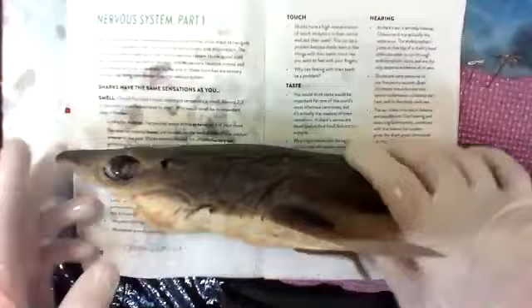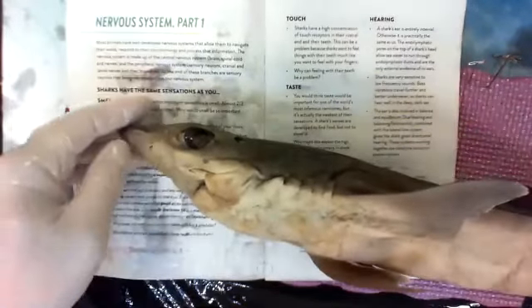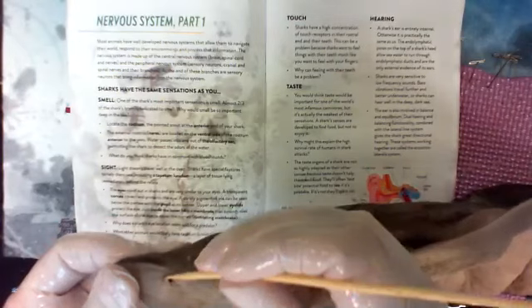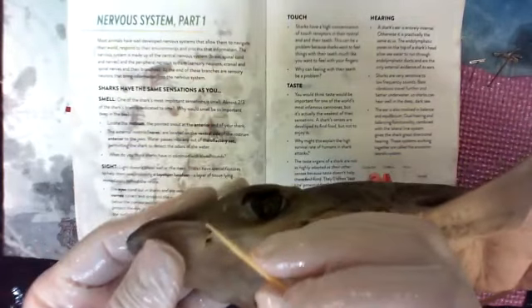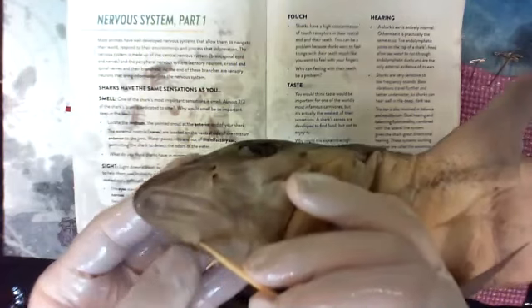So, sense of smell. There's the nostril, or the nare. If you look in there again, it's closed. It's blind-ended is what they refer to it as. So it doesn't go down and into the mouth like ours does. If you look into the nose, water's designed to go in and then it can squeeze it and flush it back out. Goes in, squeeze it, and flush it back out. So that when it smells something, you, bloodhounds, sharks, we all smell the same.